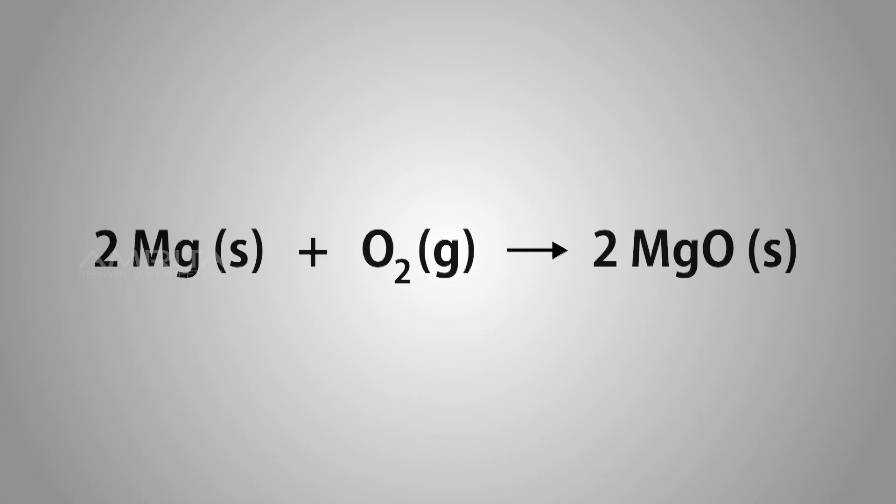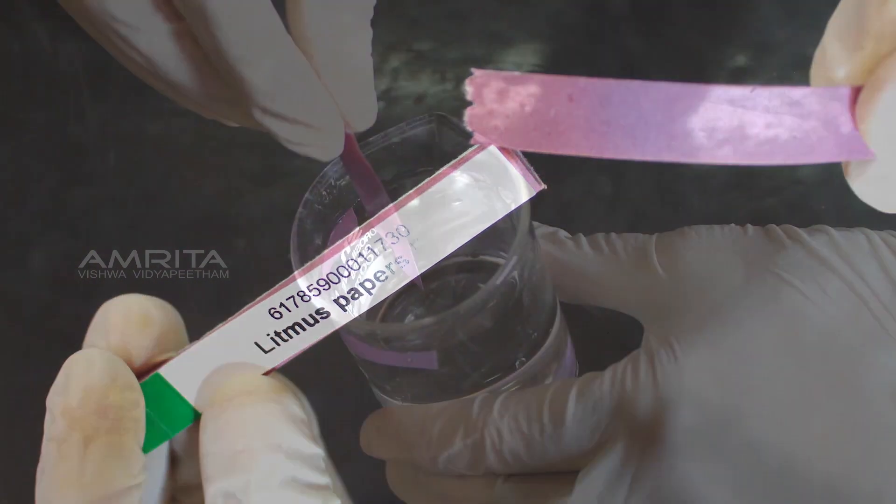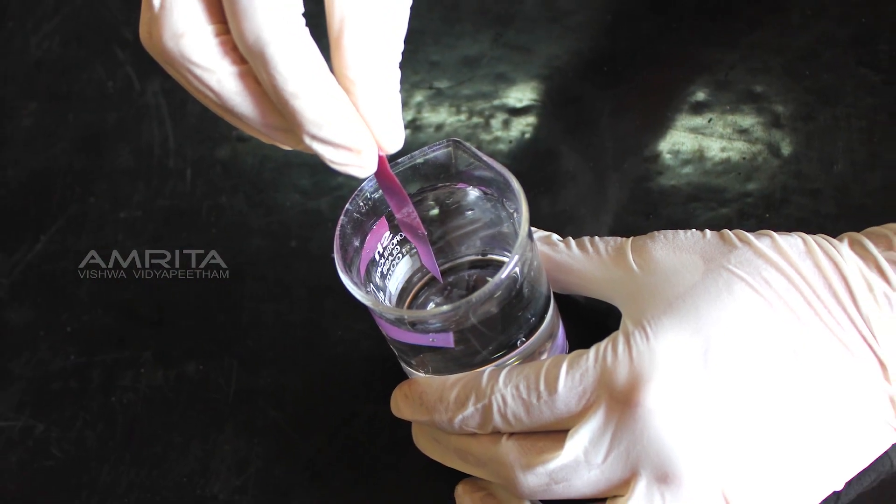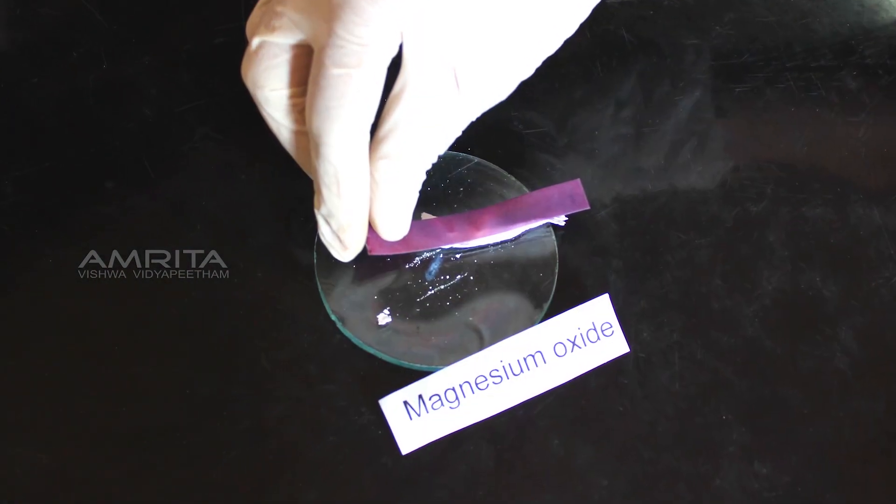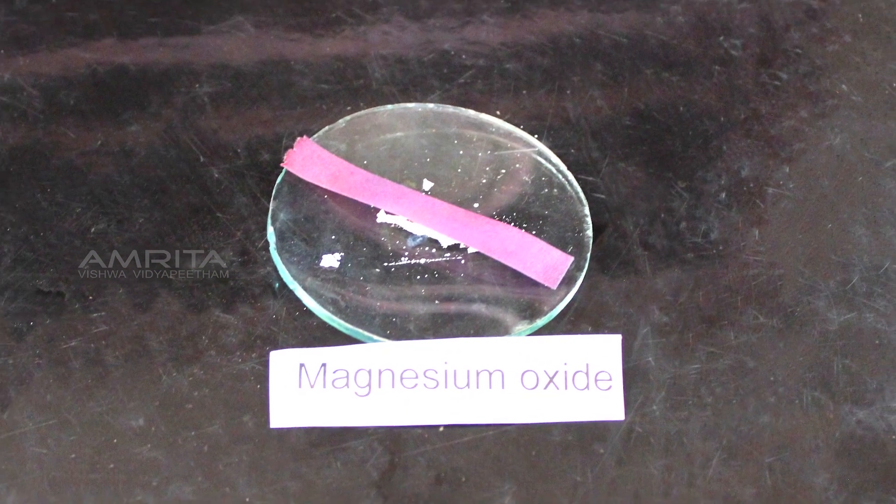Now take red litmus paper and moisten it with distilled water. Place the moist red litmus paper over the watch glass so that it is in contact with the magnesium oxide.